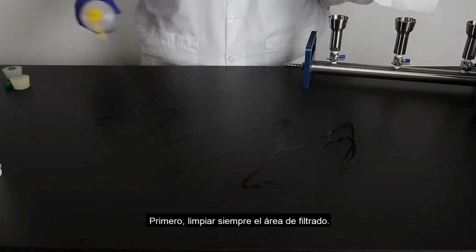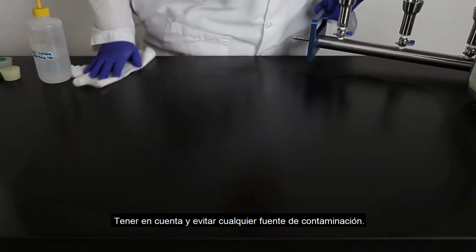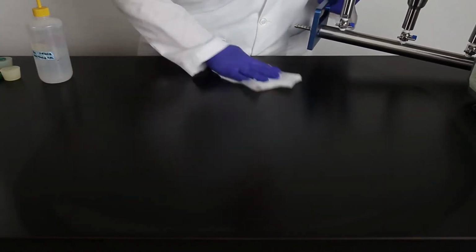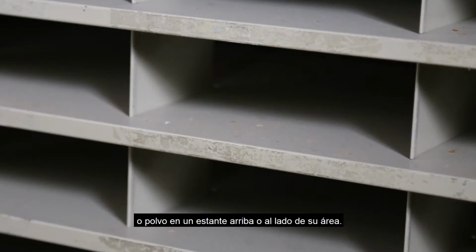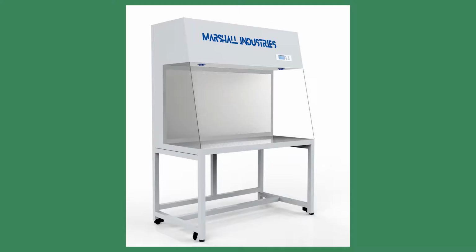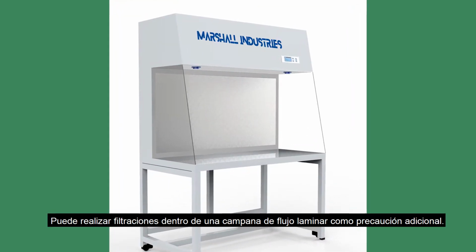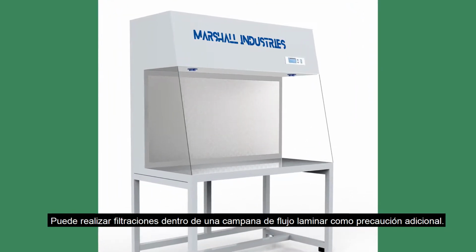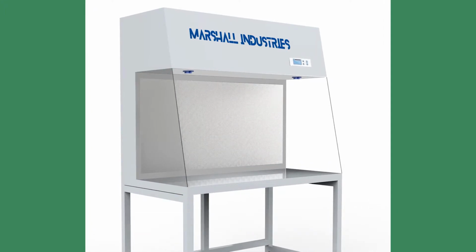First, always clean the filtering area. Be aware of and avoid any sources of contamination. This could be a vent that blows over your workspace or dust on a shelf above or next to your area. You can perform filtrations within a laminar flow hood as an additional precaution. That too should be cleaned thoroughly prior to filtering.